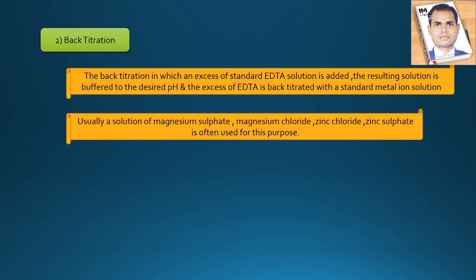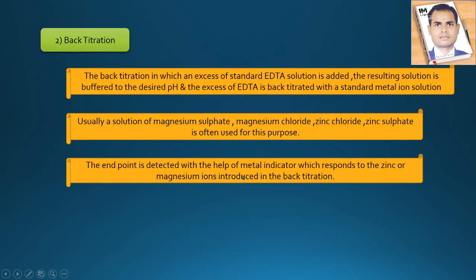Usually a solution of magnesium sulfate, magnesium chloride, zinc chloride, or zinc sulfate is used for this purpose.